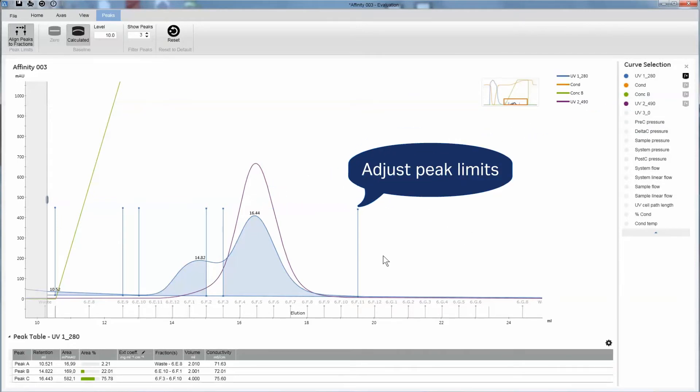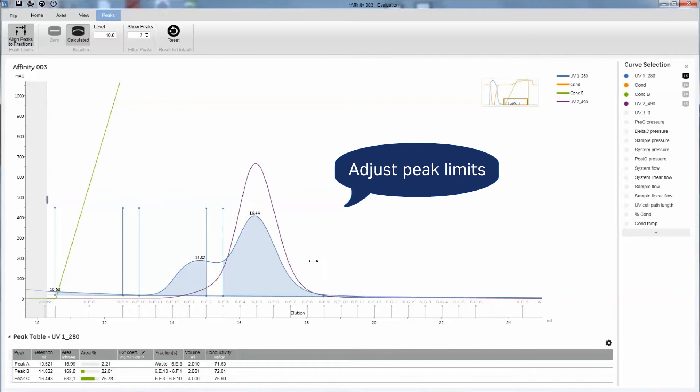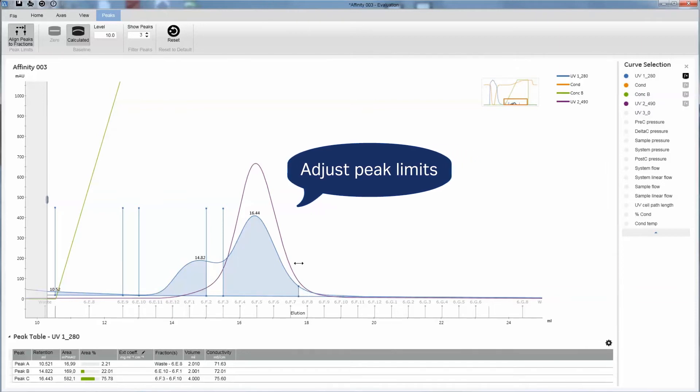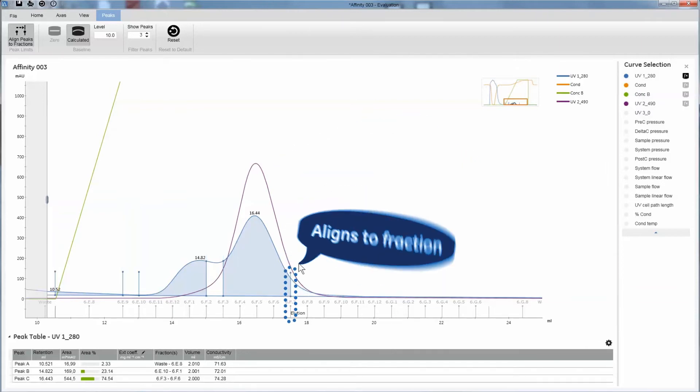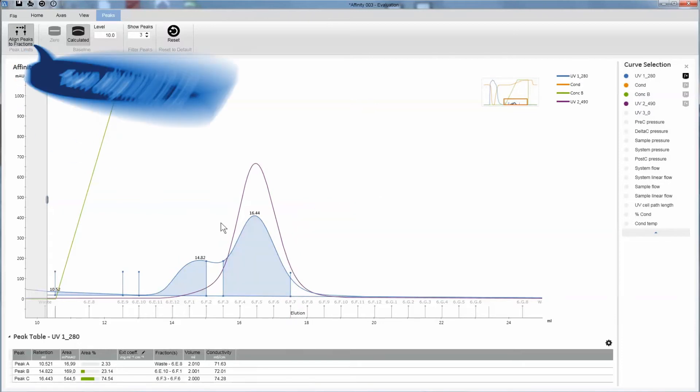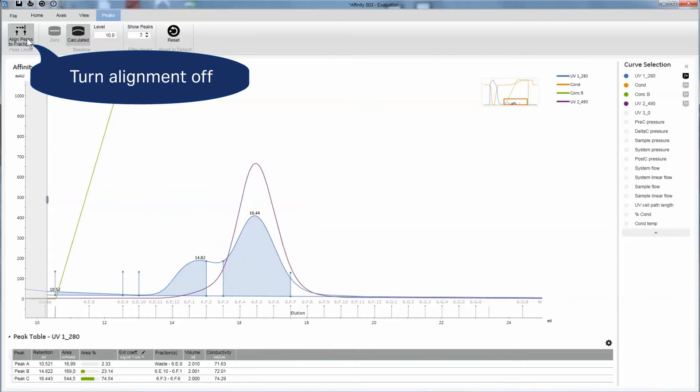Include the fractions you're interested in by moving the peak limits. Once dropped, the limit automatically aligns with the closest fraction mark. If you prefer, this function can also be turned off.